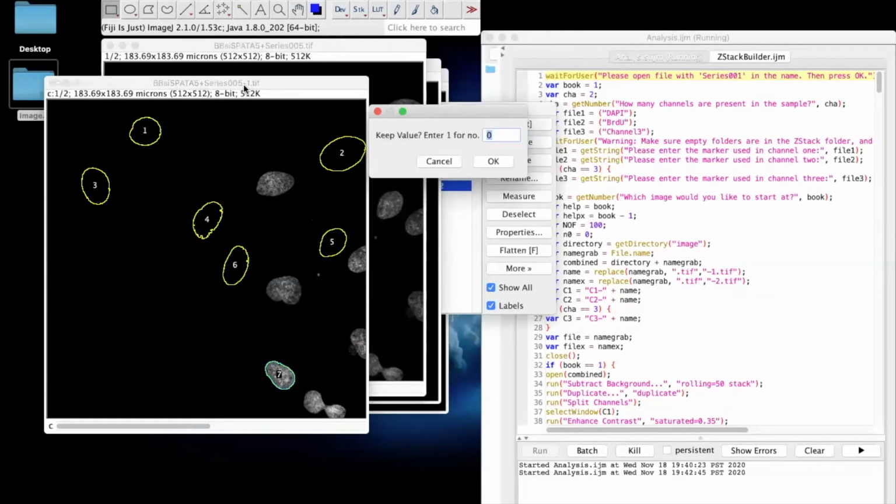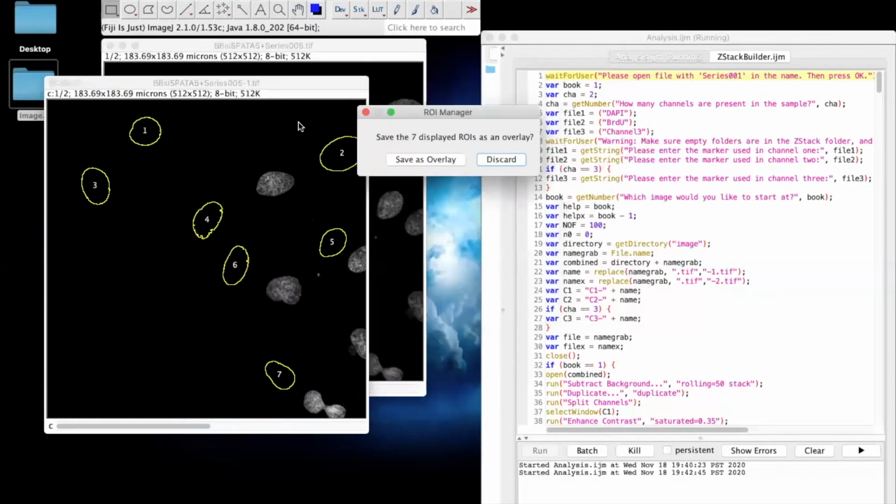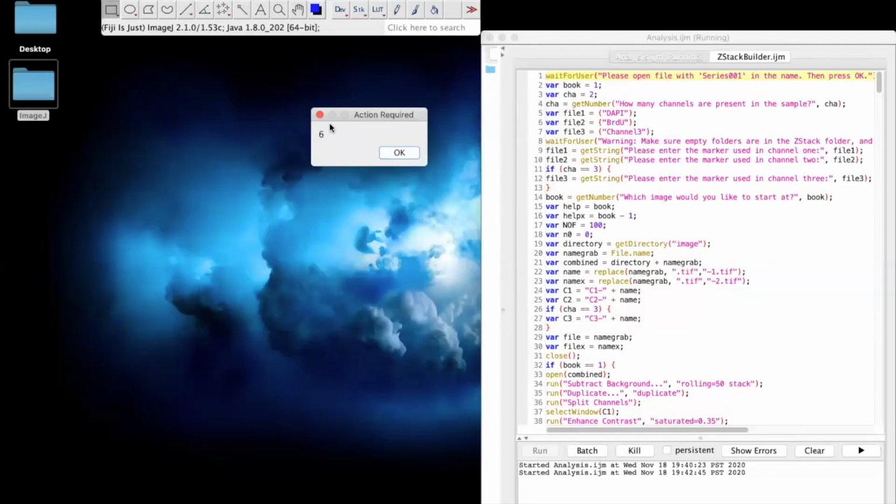No on that one. I'm being really picky. Usually, you don't have to be this picky. It usually does pretty good. And so I'll finish at that one. And then now we'll get on to getting the data into somewhere where we can actually analyze it.